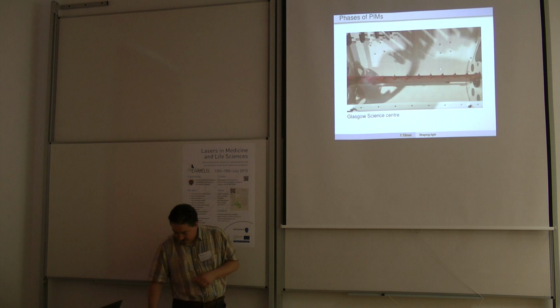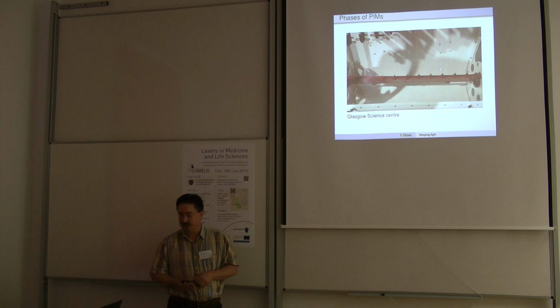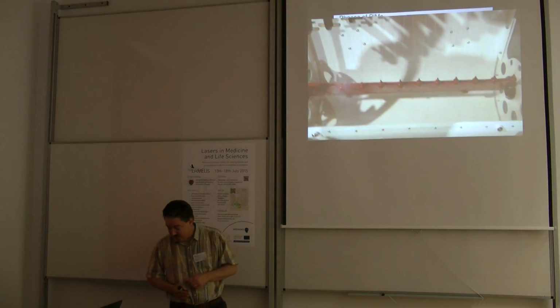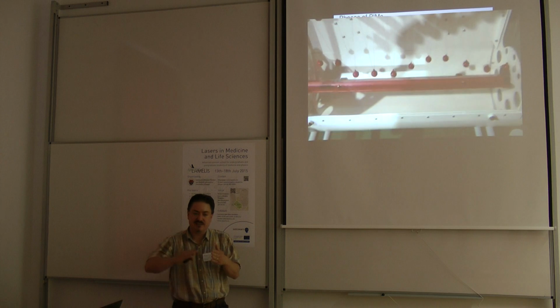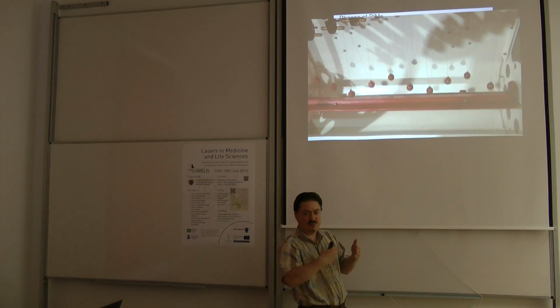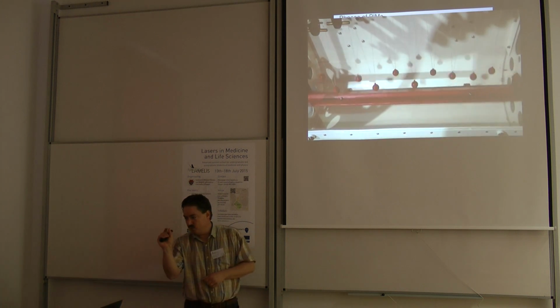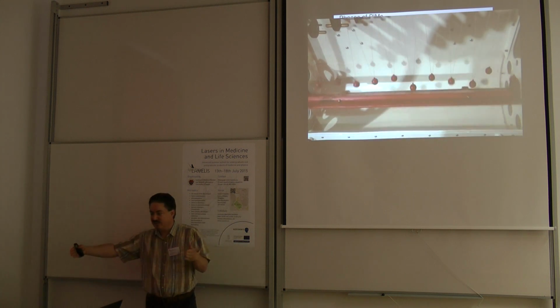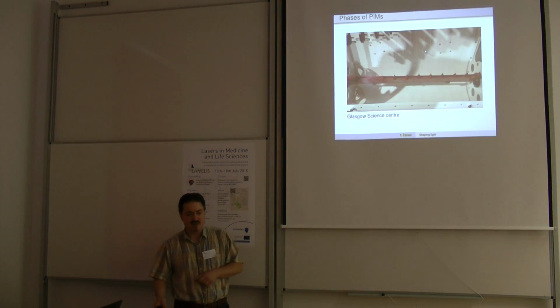And now, with this, we had to study the phases. The phases are a really important thing to consider, because if you don't predict the phases of the modes, you don't have anything. This is really crucial. And how complex it is can be shown by this movie from Glasgow Science Centre. Each of the modes has a slightly different way of oscillating, a sort of bounce in a slightly different rhythm. And because it's about 1 micrometer when it does the step, by the time it gets to, say, 10 centimeters of the fiber, they are totally out of phase. It's basically like predicting the weather for a week in advance.